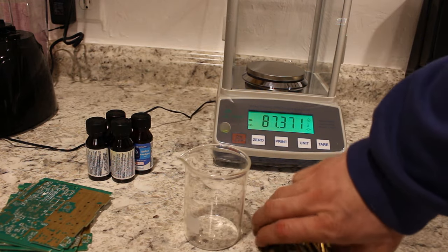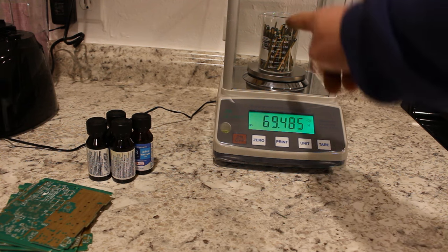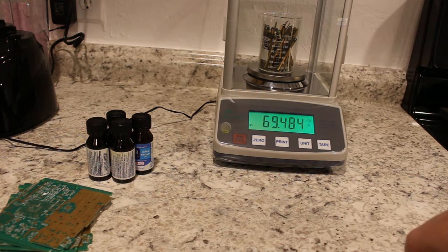Let's weigh everything. It'll tell you how much mass those fingers have. Of course, most of that mass is fiberglass.